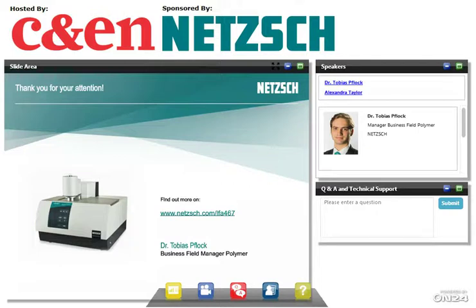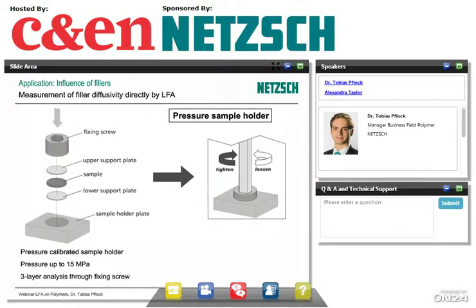Do powder materials work well with measurements, or do we have to compress them to discs? As you saw, the thermal conductivity of powder materials very much depends on the packing of the powder, so it does make a lot of sense to compress them. That is just a parameter that can be adjusted. Maybe I can go back with the slides here.